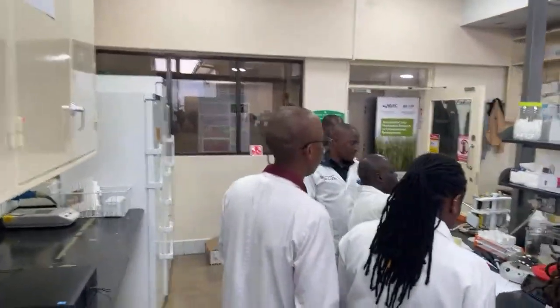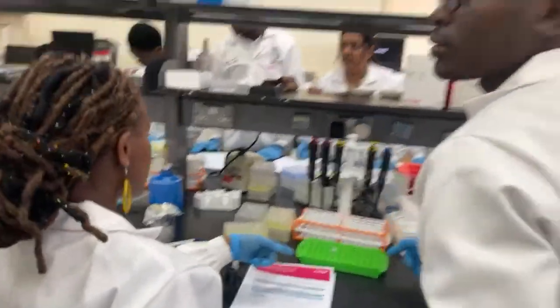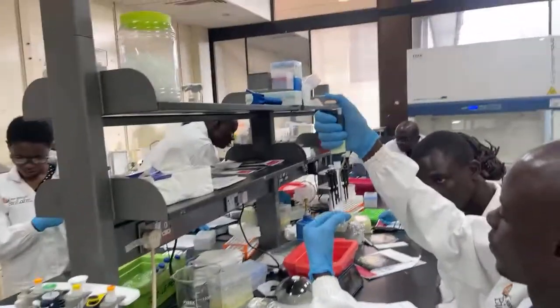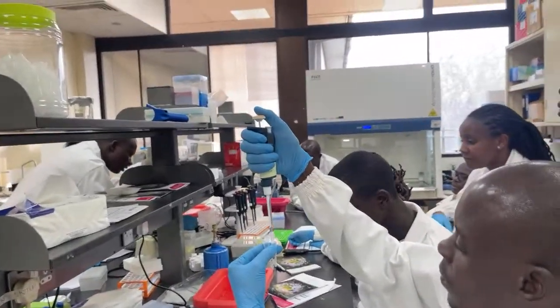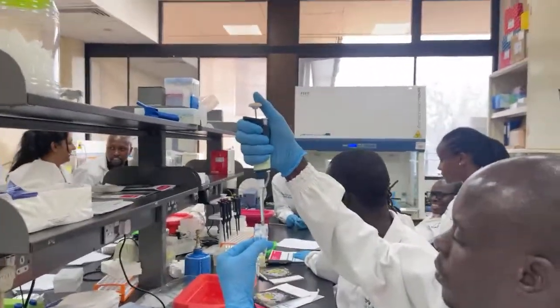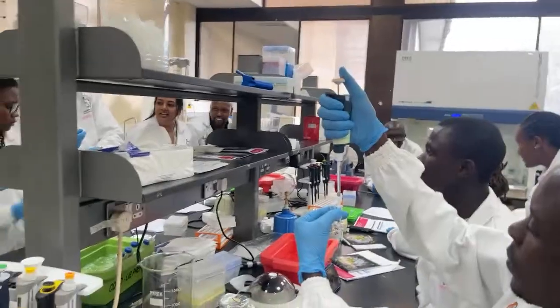Wait, are we spinning the liquid with the one with the nanobeads? You took out your liquid? Yes. Just to remove the excess. So you're spinning the nanobeads. Yeah, just to remove excess liquid. Don't spin the eluate.